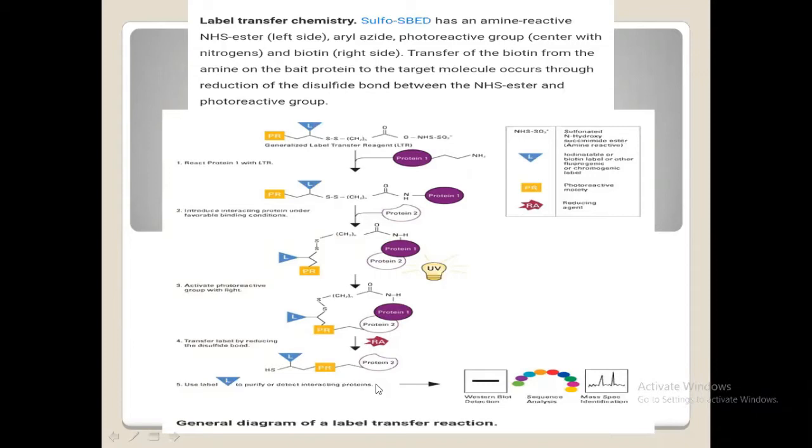How are you going to analyze them? Put them in an analyzing method like the Western blot detection method. This fragment is detected in the Western blot technique. Each fragment is detected like that. Finally, you are going to compare and analyze them. So a sequence analysis is done like this, and you will get some result.